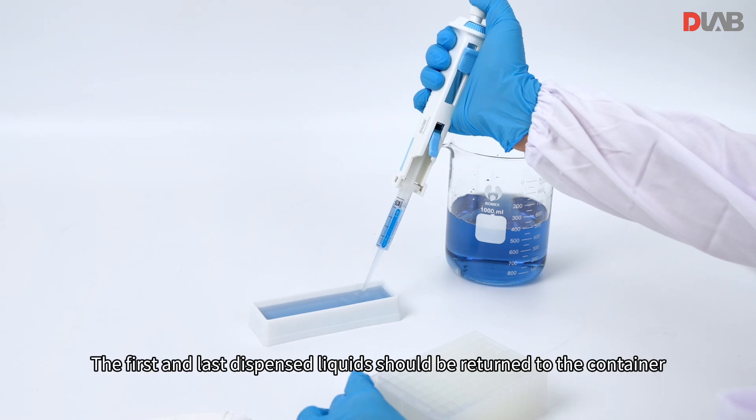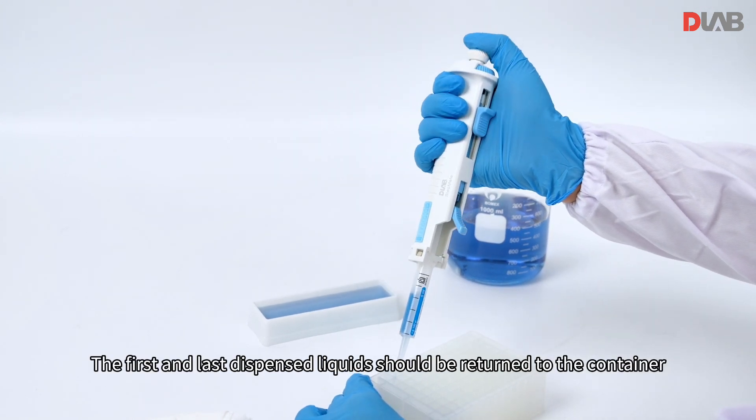This prevents tiny air bubbles in liquids. The first and last dispensed liquids should be returned to the container.